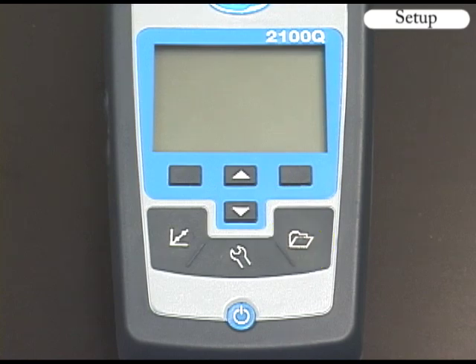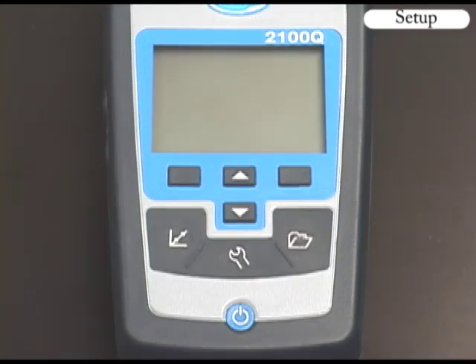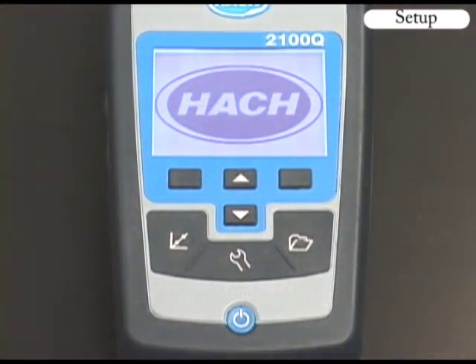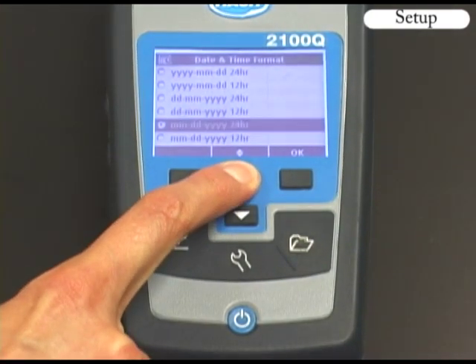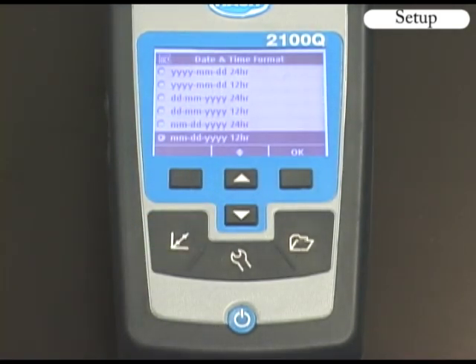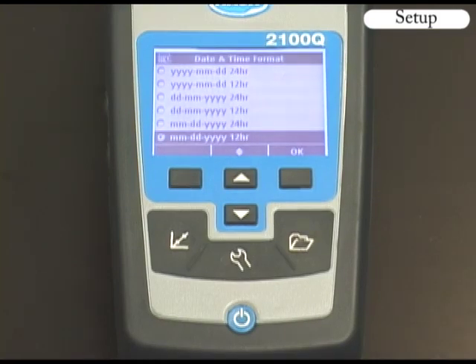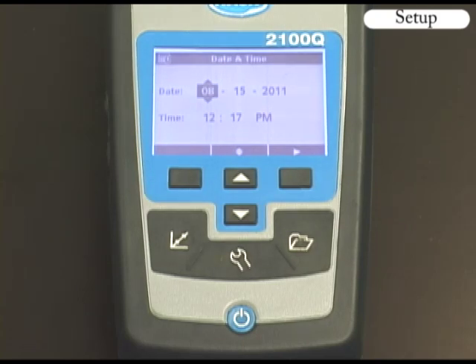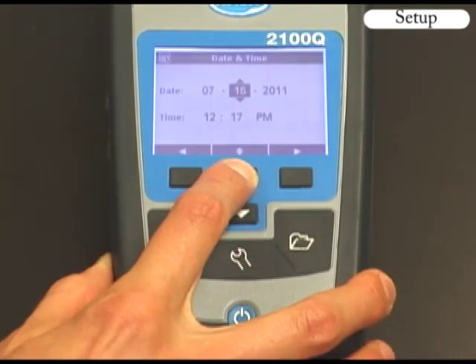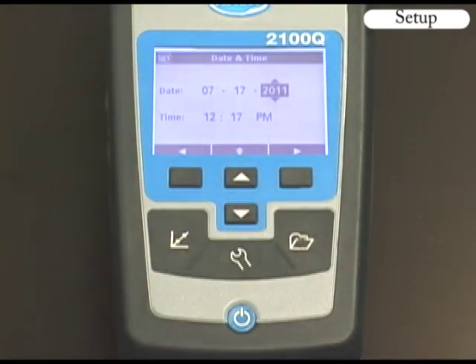The 2100Q is capable of storing 500 readings, 250 verifications, and 25 calibrations. When you turn the instrument on, you will be prompted to format the date and time. Use the up or down keys to scroll through the menu screen to find the date and time format that you wish to use. For this demonstration, I will select month, day, and year with a 12-hour time format. Use the up or down keys to select the month, then use the right key to scroll to the next option.